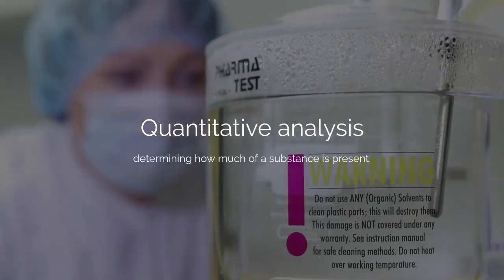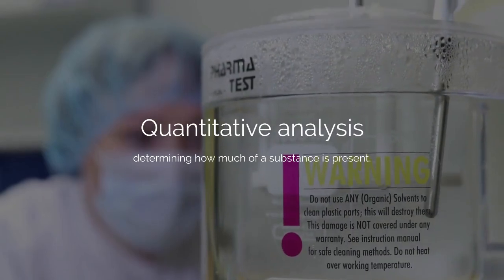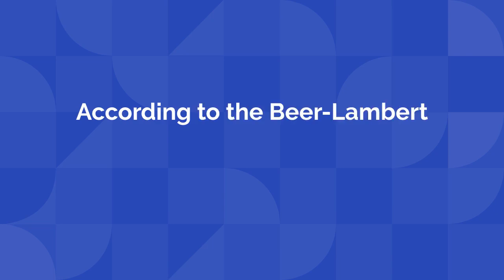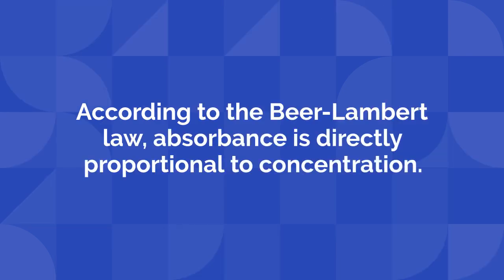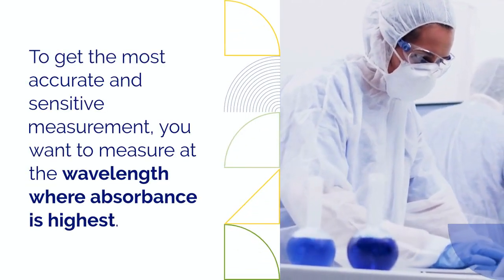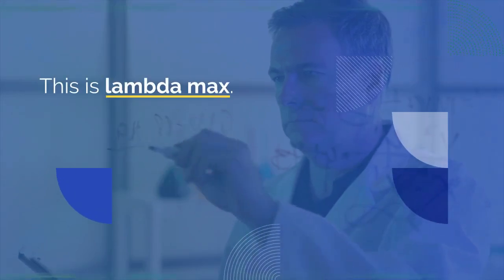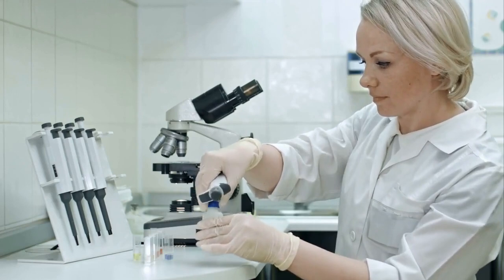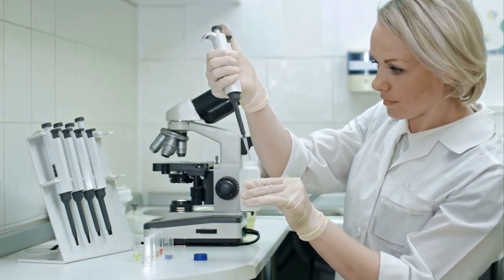The second, and perhaps more common reason, is for quantitative analysis, which means determining how much of a substance is present. According to the Beer-Lambert Law, absorbance is directly proportional to concentration. To get the most accurate and sensitive measurement, you want to measure at the wavelength where absorbance is highest. This is lambda max. At this peak, even a tiny change in the concentration of the substance will cause a significant, easy-to-measure change in absorbance.